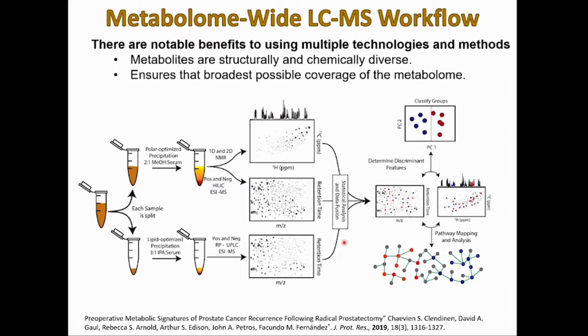But careful what you wish for, because there is such a thing as too much data. And the postdoc working on this literally spent a year and a half analyzing the data from this study. So it was almost too much, you know? So we've learned the hard way that sometimes it's better to start with maybe one of the chromatographies and see if there's interesting information there, and then you can expand it to other types.